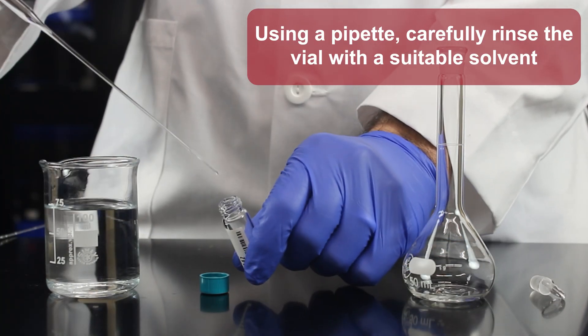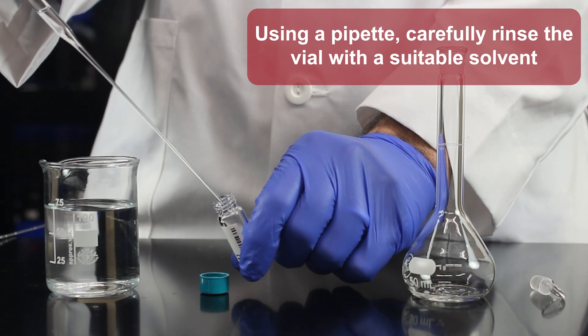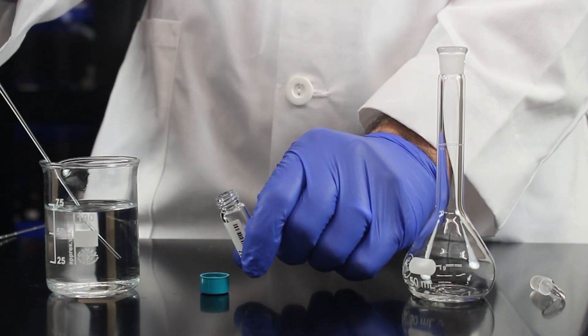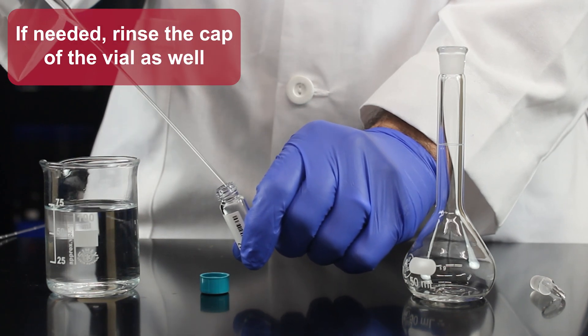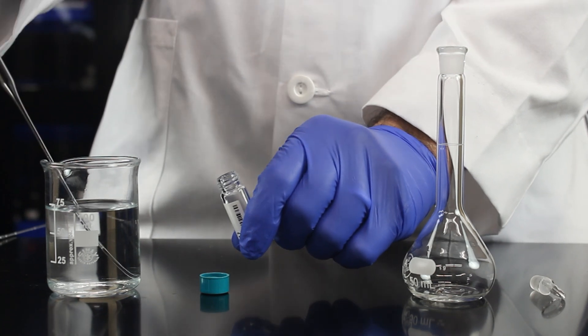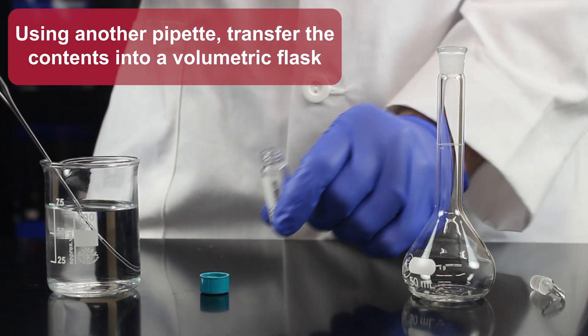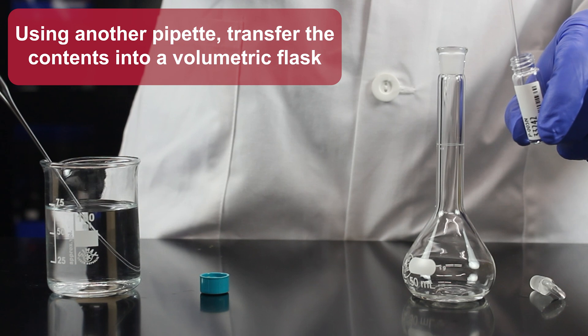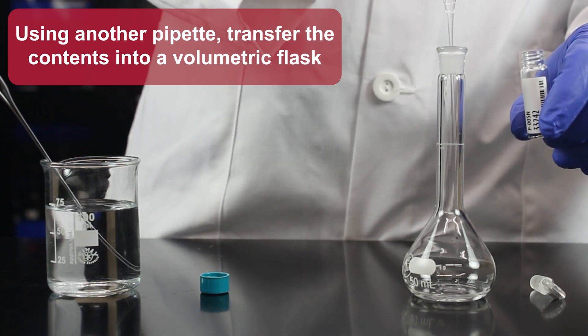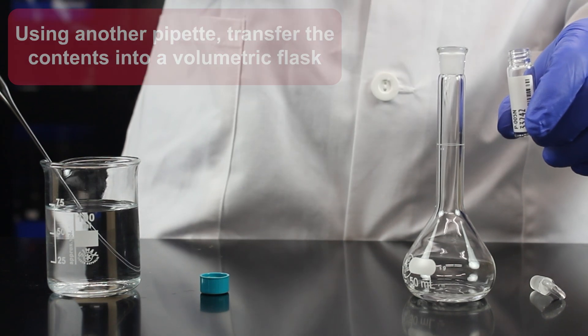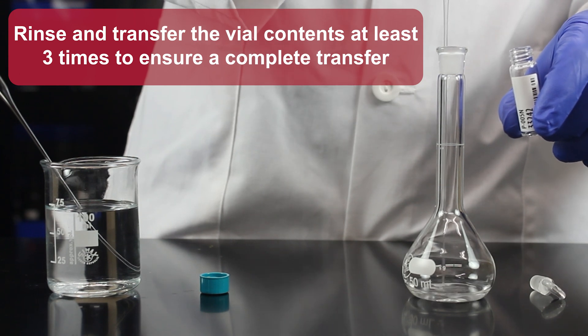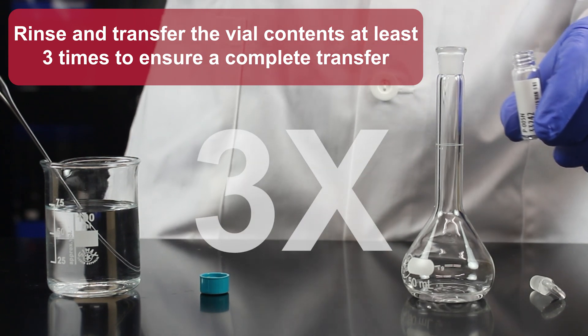Using a pipette, carefully rinse the vial with a suitable solvent. If needed, rinse the cap of the vial as well. Using another pipette, transfer the contents into a volumetric flask. Rinse and transfer the vial contents at least three times to ensure a complete transfer.